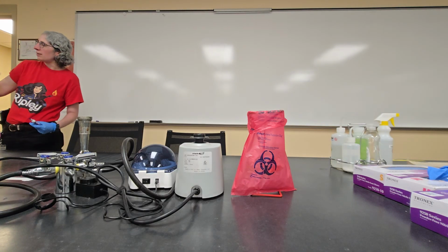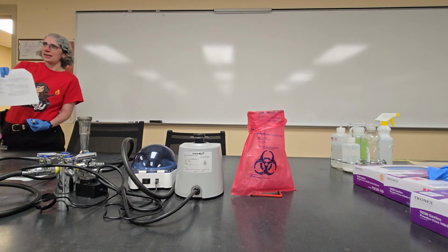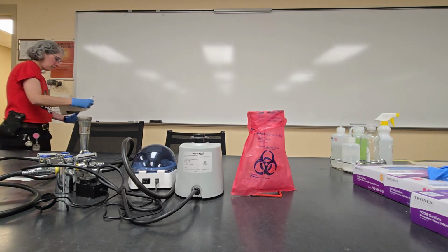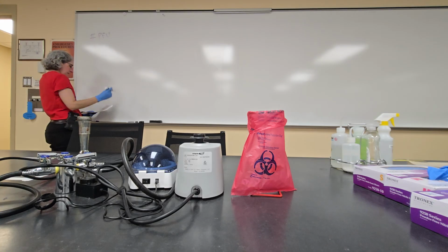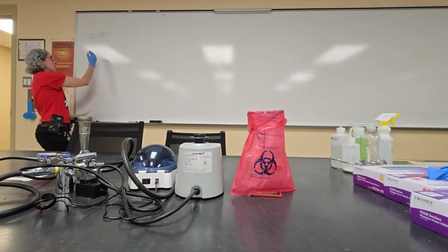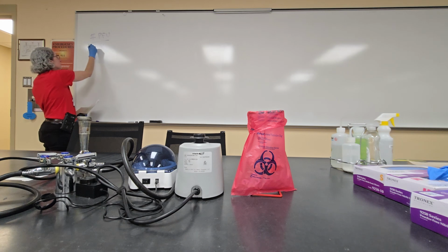Okay, and so there are two formulas that you could potentially use. So there's the one that they provided at the phage program, which is your number of plaque forming units. So the number that you counted, divided by the number of microliters that you used to infect, right? So your volume you use for infection, in microliters, right?